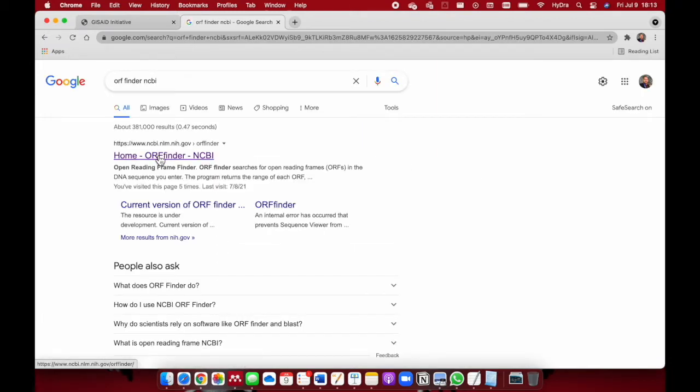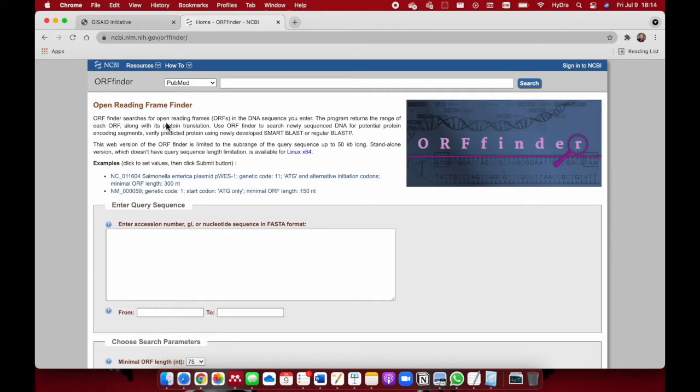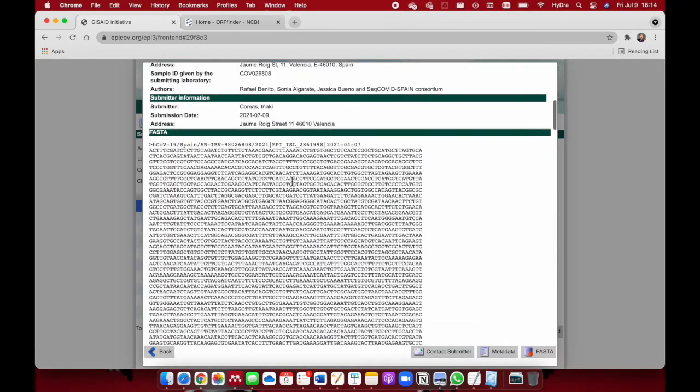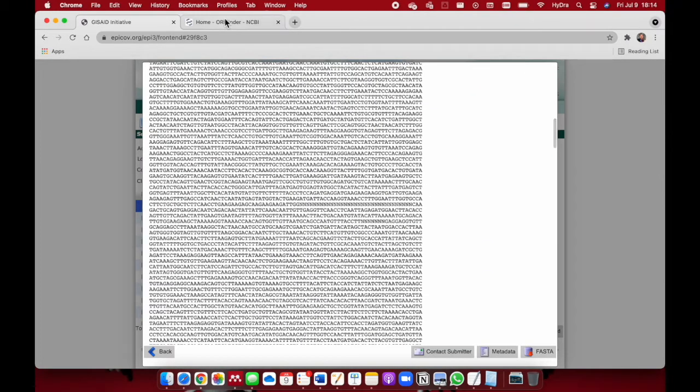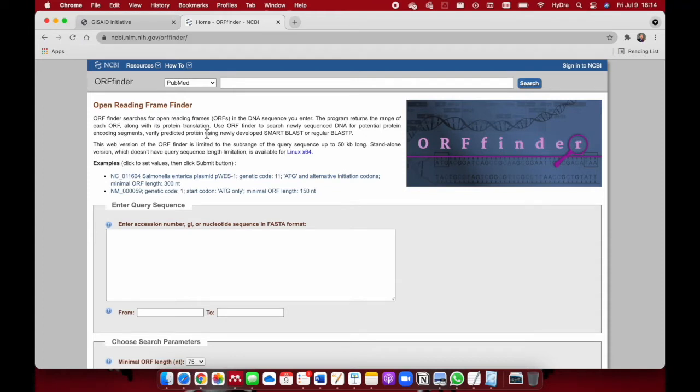Click on the first option, ORF finder NCBI. ORF represents Open Reading Frame Finder. It searches for open reading frames in the DNA sequence you enter. The program returns the range of each open reading frame, showing how many nucleotides exist between one open reading frame to another, along with its protein translation. Use ORF Finder to search newly sequenced DNA for potential protein encoding segments.